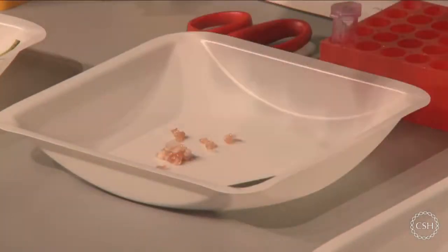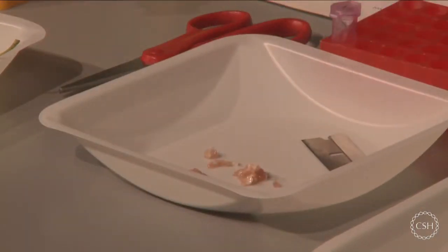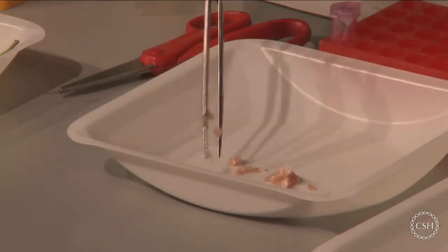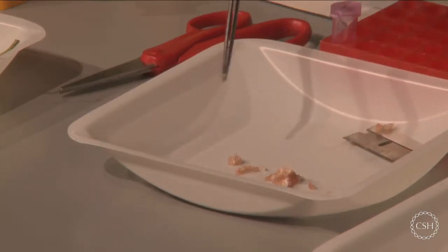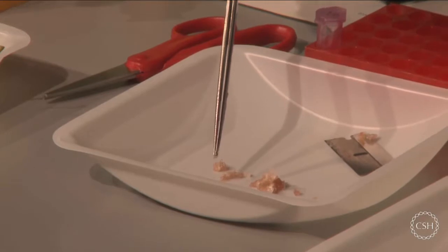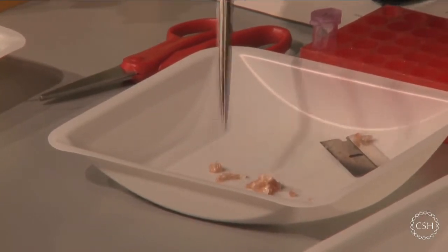All right. So what I'm going to do is point here, and this is all that I physically want to work with. It's just this little bit of section right there. I'm going to clean off my forceps here so I don't need all this stuff. All I want is that piece right there. I don't want any more than that, okay? Any more than that, I might have a problem.